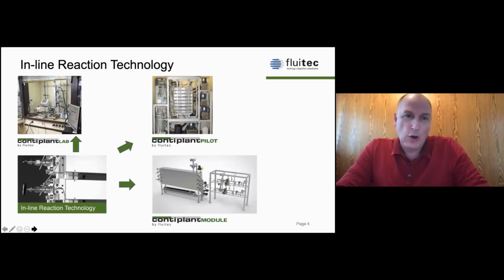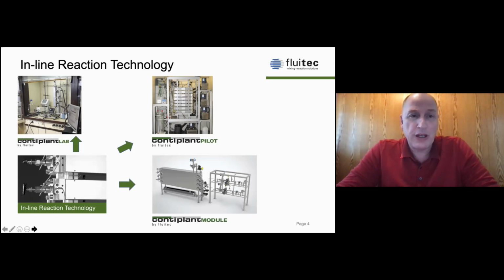About 13 years ago, there was a European project called F3 Factory. In this European project, with a volume of about 30 to 40 million euro, one of the targets was to develop laboratory equipment which is able to scale.